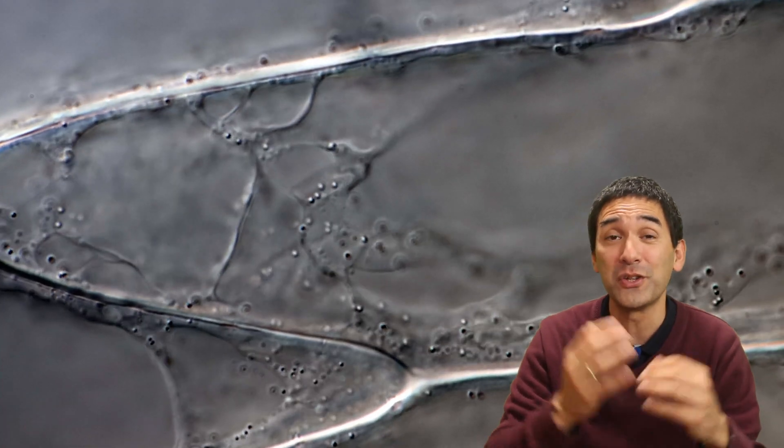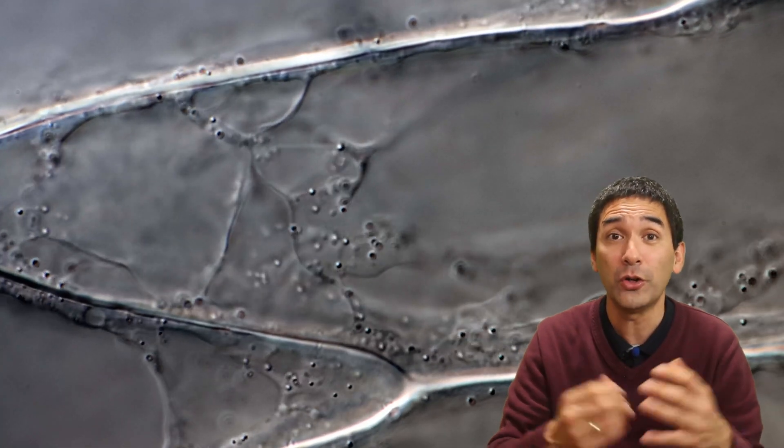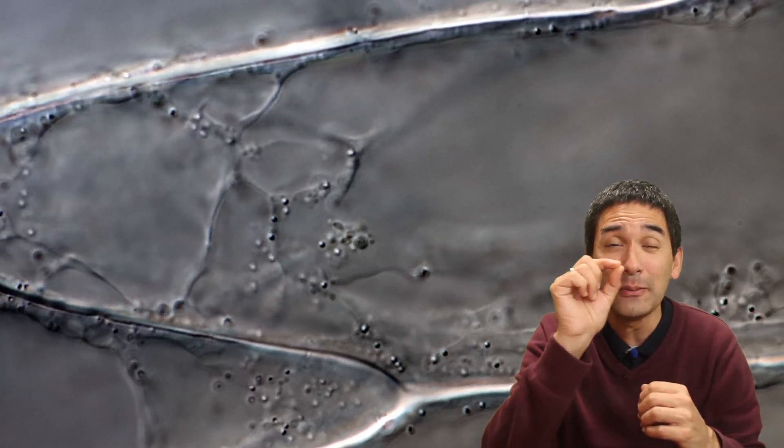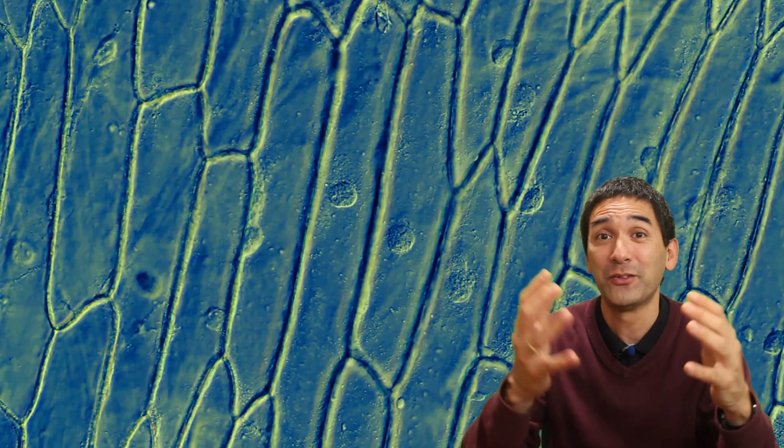As a matter of fact, those onion cells are indeed very large. If you use a strong magnifying glass, then you're also able to see the elongated structure of those cells. I really highly encourage you to grab yourself an onion and put it under the microscope if you have not already done so.